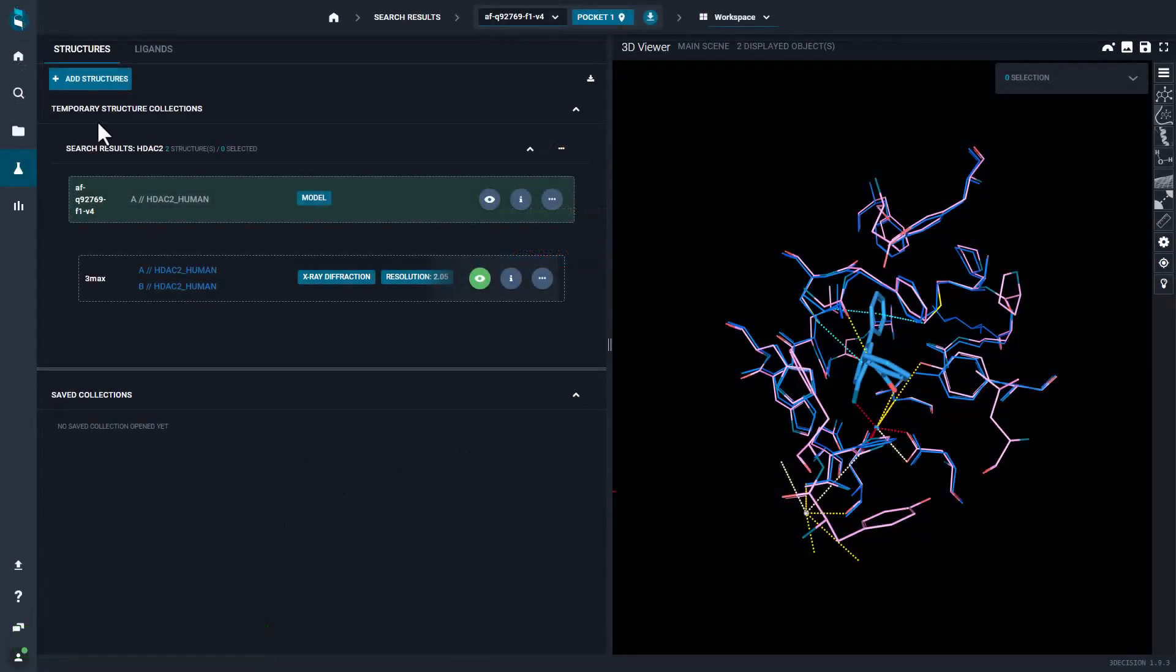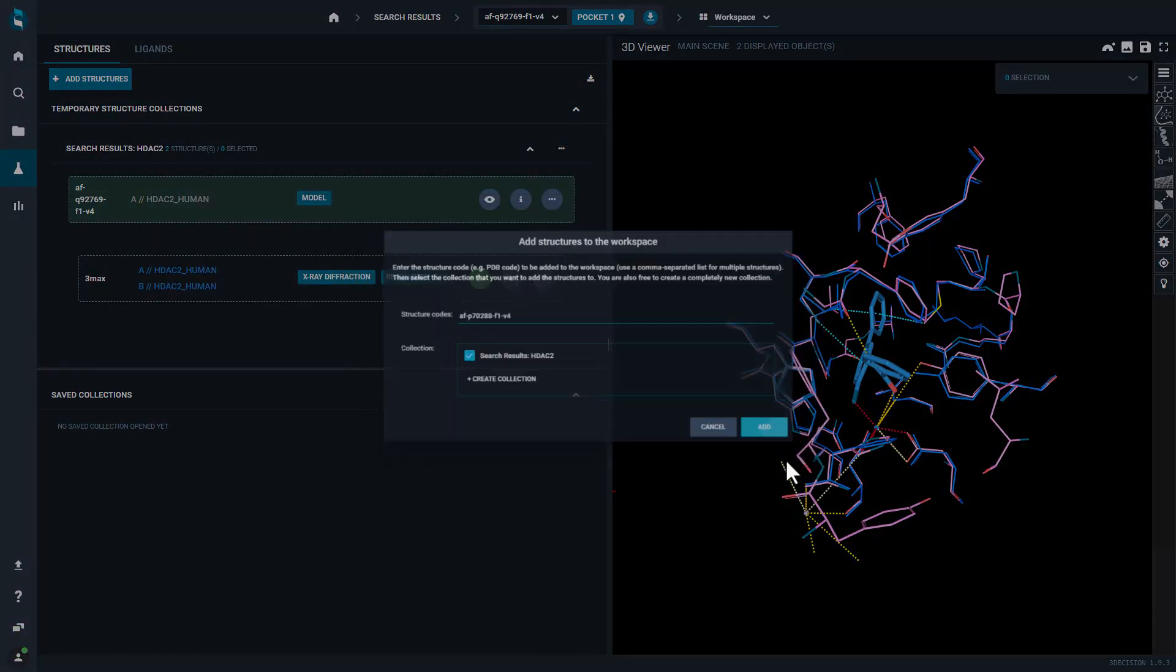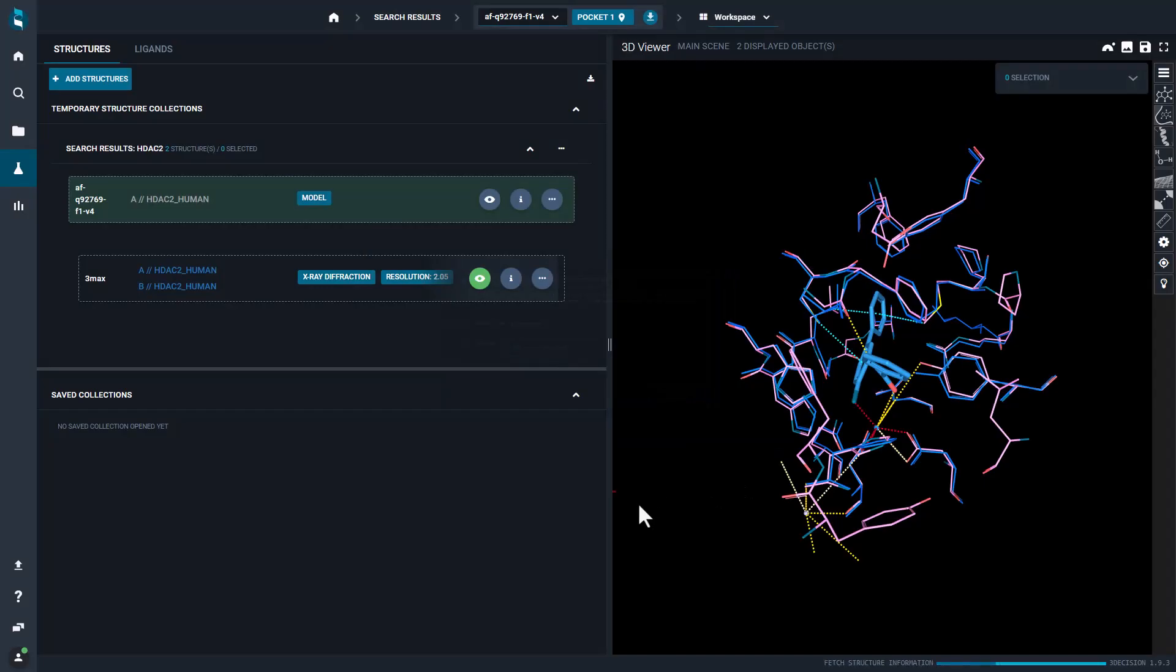You can then use the newly registered structure, for instance to compare it with other structures of the same target.